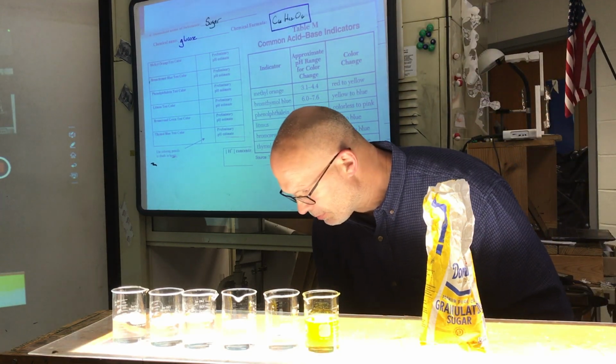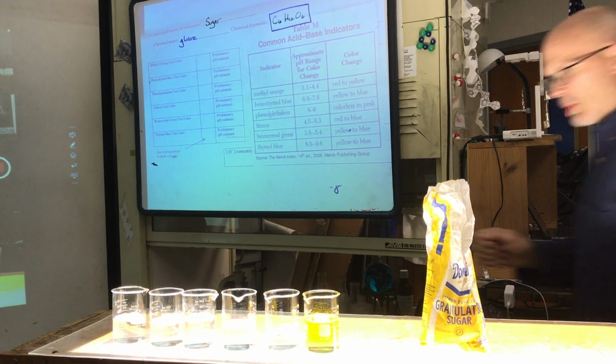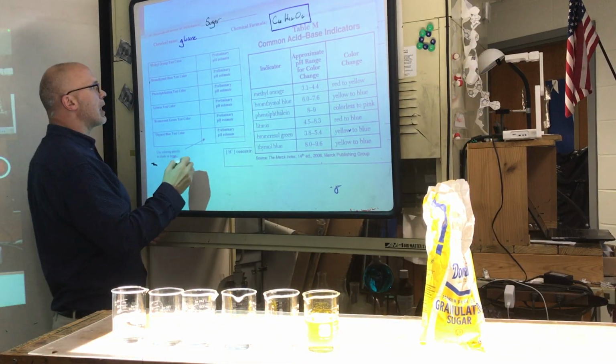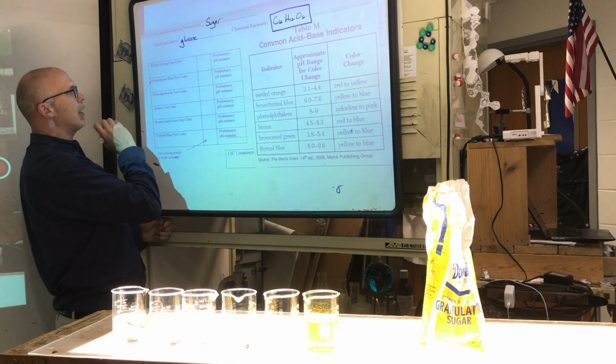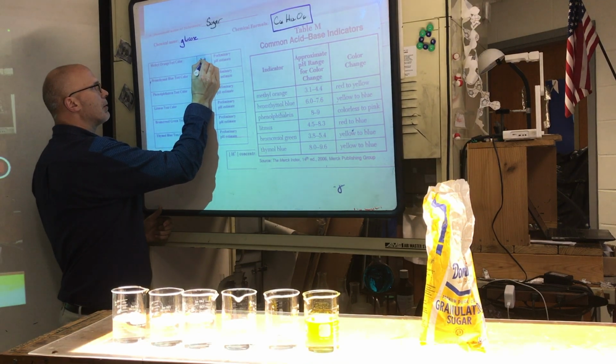What does this tell me? Oh, we need our what? We need our, yeah, can you pass those out for me, Haley? The colored pencils. So we've got ourselves methyl orange test. We've got ourselves a yellow. So yellow, and color that in there.